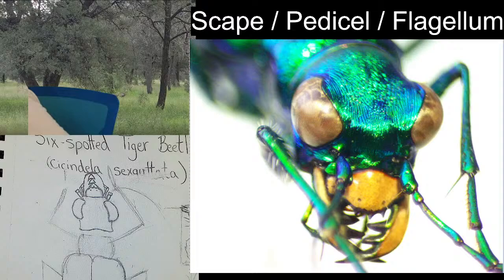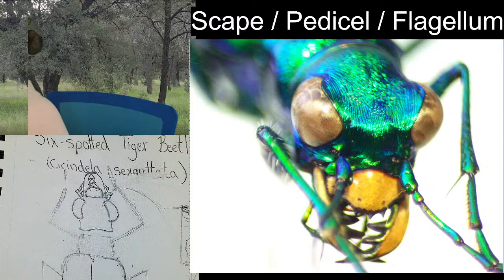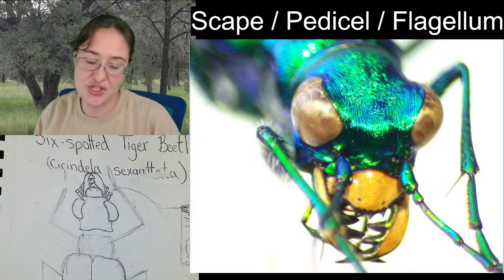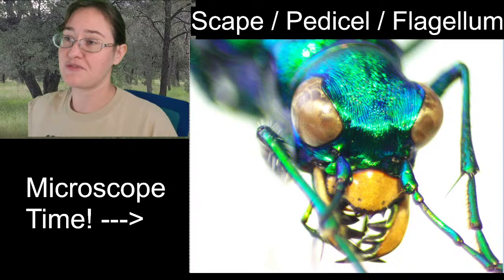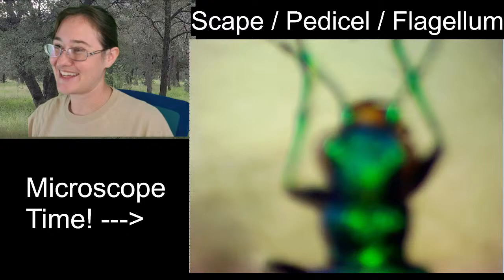If I was going to throw out a guess, I believe that this specimen is female. I was told by someone who studies tiger beetles that when they're males, the tibia on their front legs have a series of comb-like hairs that are used in the mating process, whereas the females don't have those hairs on the bottom of the front tibia. So when you're looking to determine male versus female on tiger beetles, you're going to look at their front legs. The boys have hairy front legs and the girls do not, is the moral of that story.